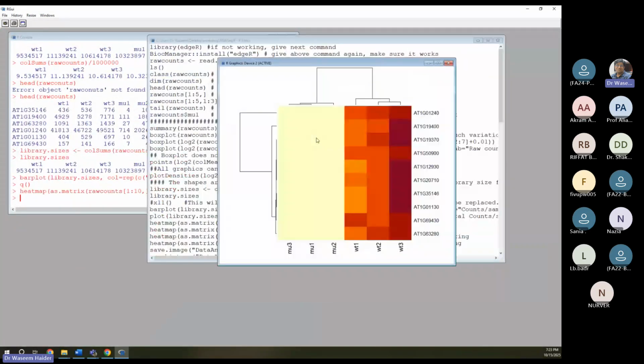You can put these things on top of each other. So what heat map is doing, heat map is showing these numbers in what we call a heat diagram. So low heat, white, and then red is where there is more heat. Initially, when it started, it was the other way around. Red was low heat, white was more heat. The reason behind that was the sun is hottest at 12 p.m. So at that time, its color is white. During the early mornings and during the time of the sunset, the sun color was red. But now they fixed that actually. So the low numbers and high numbers, they are here.